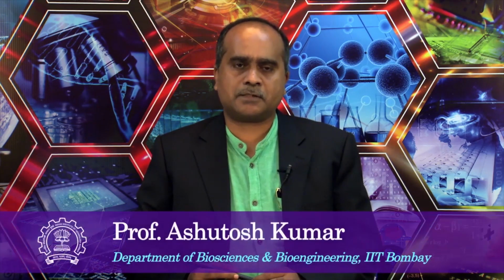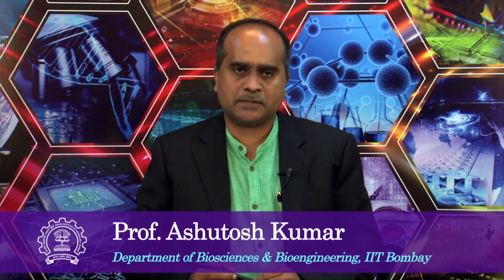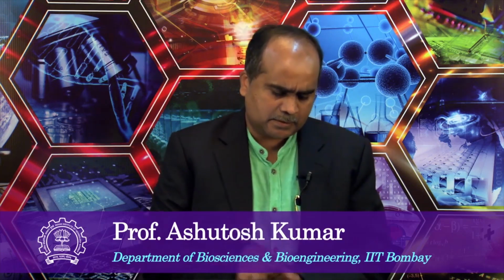So, welcome to today's class. We were discussing polarization transfer and we will take some advanced topics in polarization transfer. In the last class we had looked at how we can enhance the sensitivity of X nuclei by selective polarization inversion. That means if A and X spins were coupled, we were selectively inverting the population of one of the transitions in A spin, and because of that population inversion the intensity of X spin got enhanced.